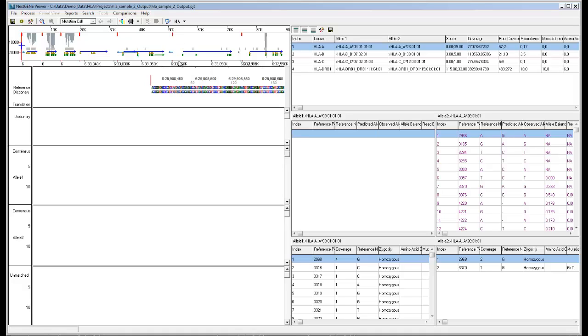The HLA report shown on the right consists of three parts. The HLA summary report shows the top allele pair matches for the gene. The number of top allele pairs shown for each gene can be set in the HLA report settings. This example shows the one top allele pair match for each gene.